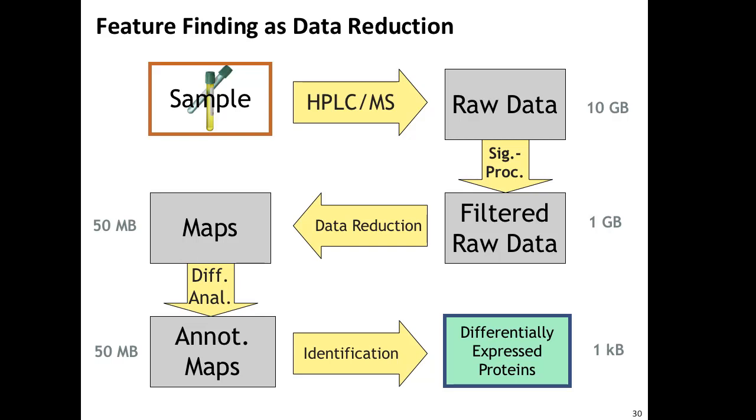It seems like the alignment of features is such a... We will go into that. But the reason why we need to do alignment is really the instability of the chromatography. The way we can correct for that is really through the mass, because the mass is more reproducible than the chromatography.